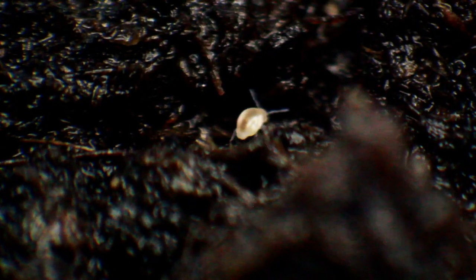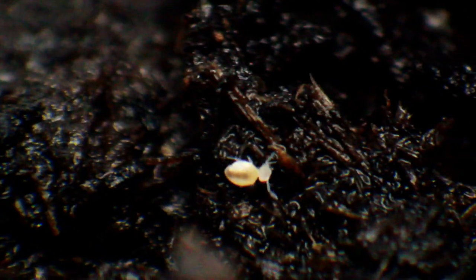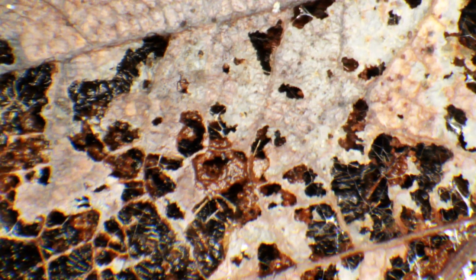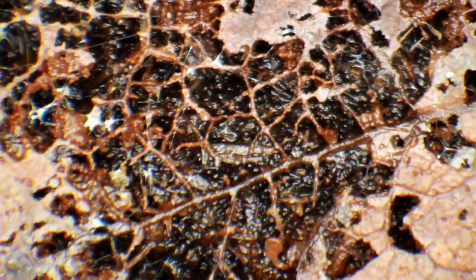Our little friend is crawling around looking for a place to hide. With the zoom function I'm able to zoom in and refocus — huge antennae. It's an insect, of course, because it has six legs, so it's quite easy to identify. After a few more days, some of the leaves really started to decompose quite well — at the beginning nothing much happened, but then they progressed. This one is the birch leaf.